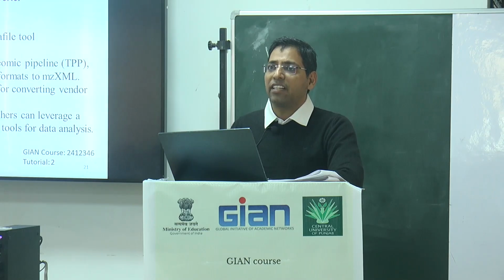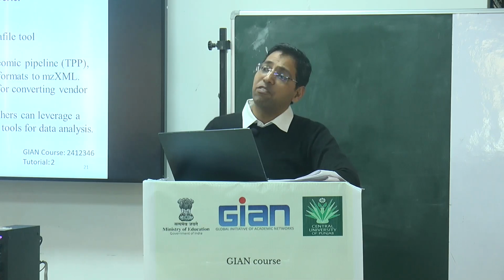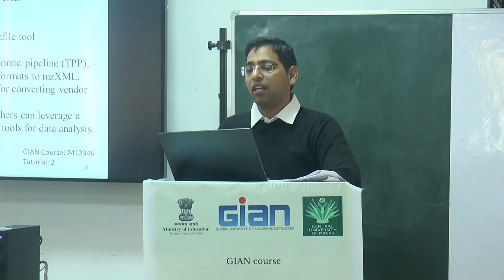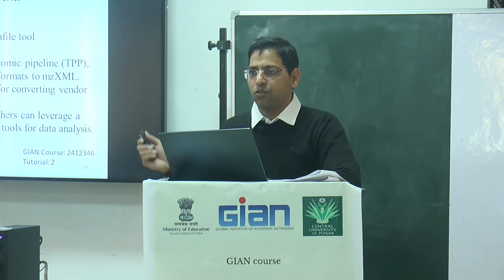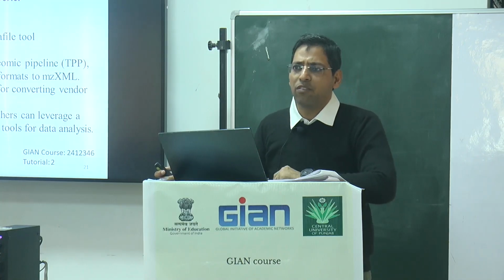By converting data to the open format, we are able to use different types of statistical tools and bioinformatics tools for the data analysis actually. So that's why we have to convert it. It is a mandatory thing. Otherwise, how could you do the bioinformatics analysis?